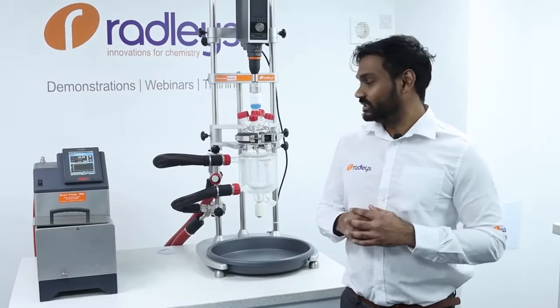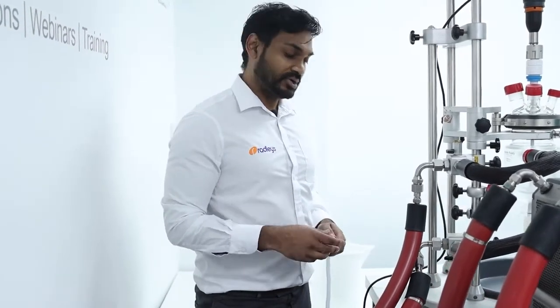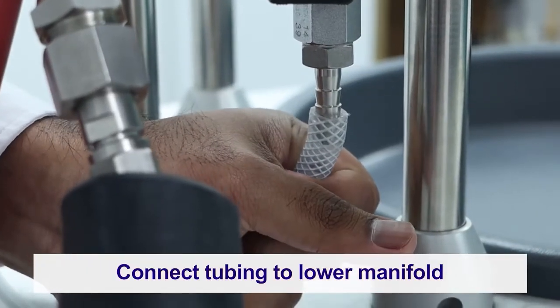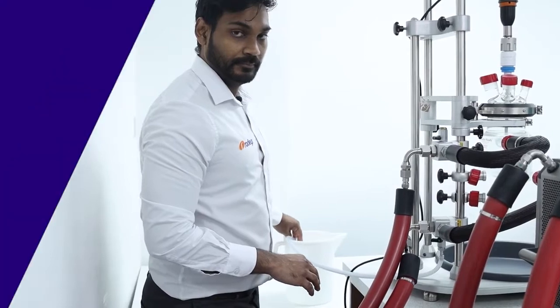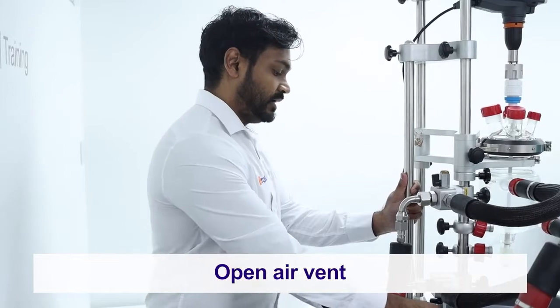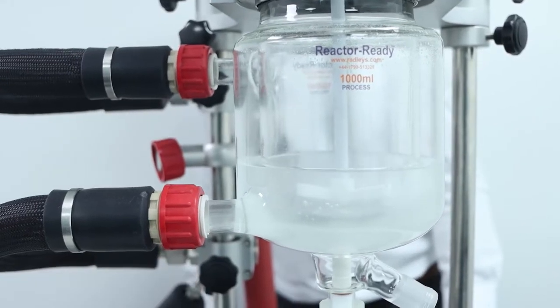Now we're going to go through the process of draining the thermal fluid from the system so that we can swap this vessel for a new one. With the reactor ready manifolds, draining the thermal fluid is a simple process. First, attach a bit of tubing to the hose barb on the lower manifold and put the other end into an external container. Next, open the air vent on the upper manifold and the drain valve on the lower manifold, and the thermal fluid will drain from the jacket of the vessel into your external container.